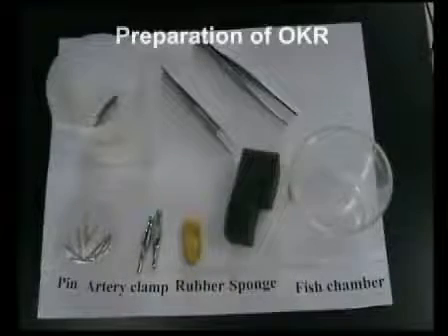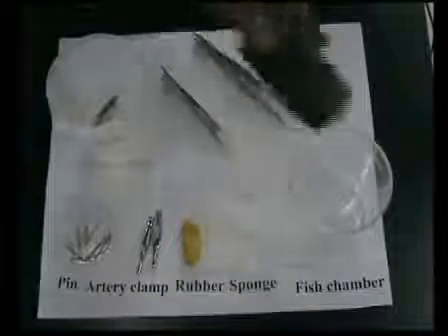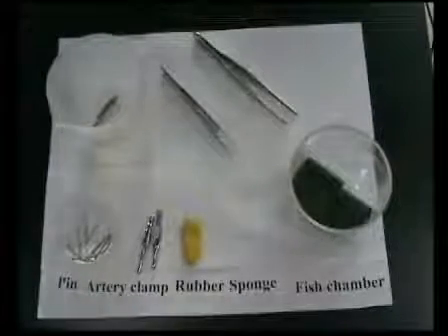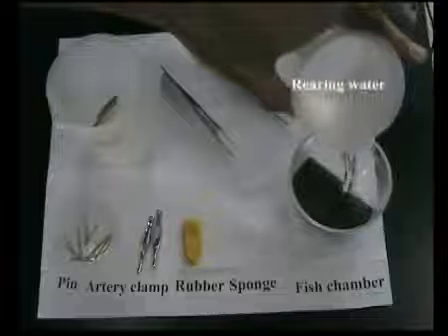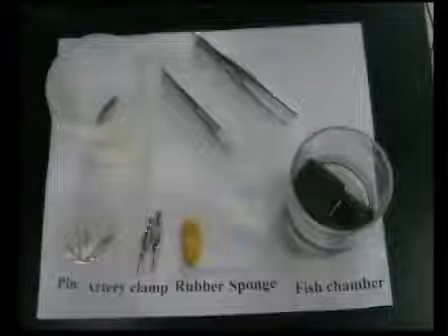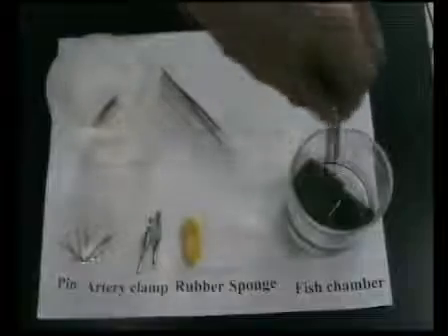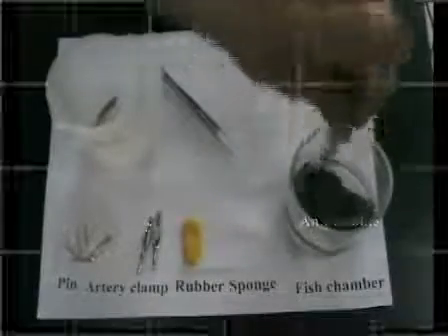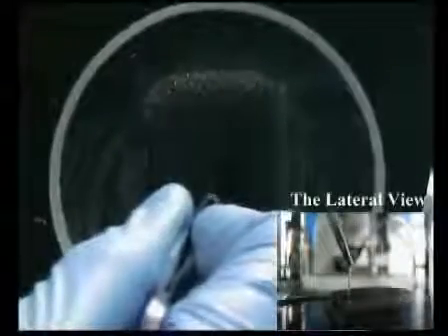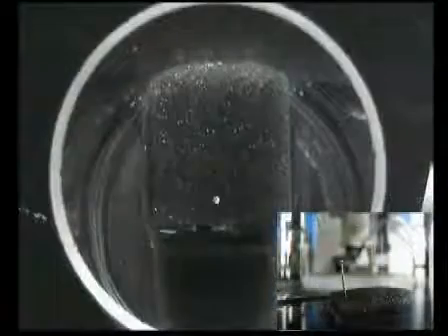First of all, we're going to show you how we did the OKR test for adult zebrafish. Put the sponge into the fish chamber and pour some water into it. Squeeze the sponge a little bit to get rid of the air bubbles. Now, we're going to show you how to fix the fish with pins step by step.